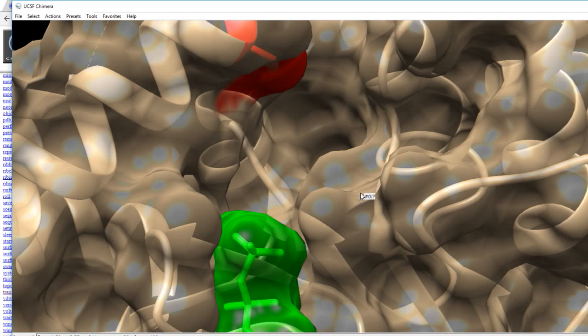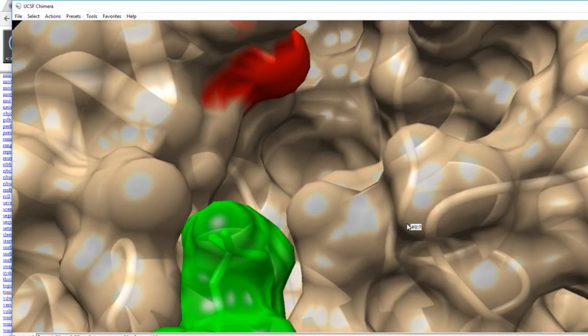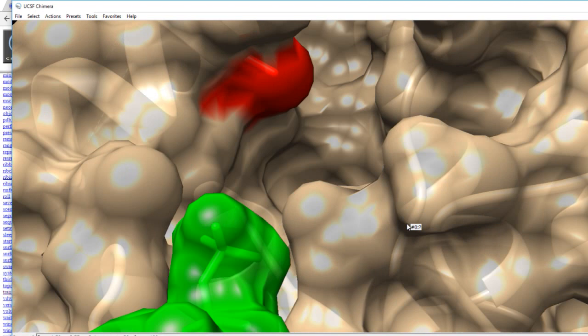So here we've gone right in, you can really see the cavities in the protein structure that will lock in a substrate. Once it gets to the point where it's not having to recalculate the surface, it should speed up a little bit. There we go. It's sped up a bit. Bear in mind that each of those pictures has been written to disk, each frame, and now it's using this FFmpeg program to combine those and make a movie.